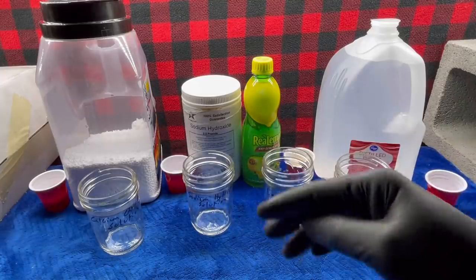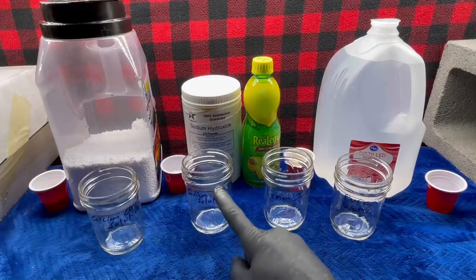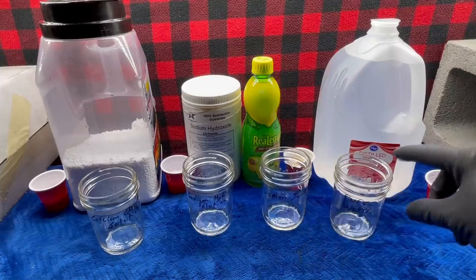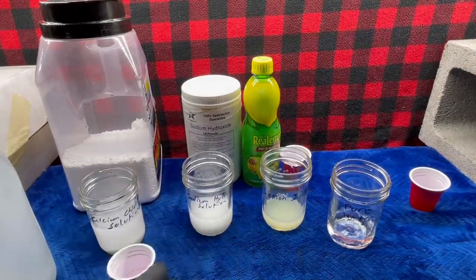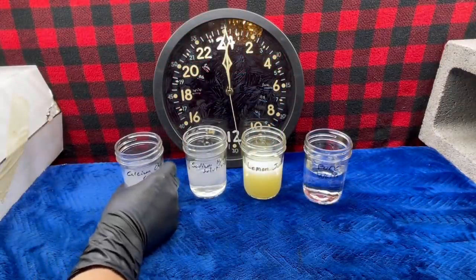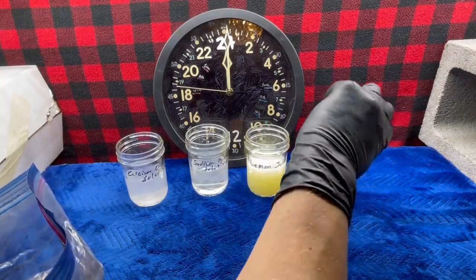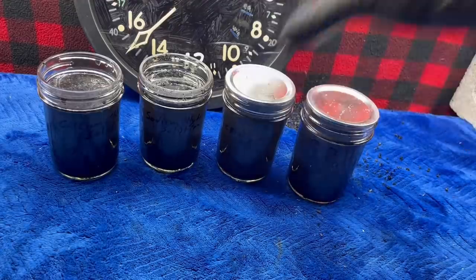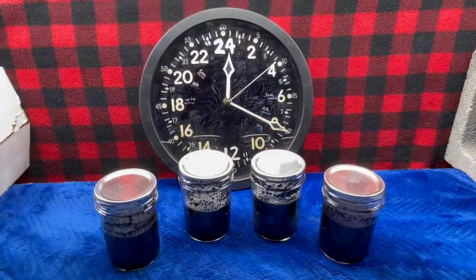Here's what I'm going to use to attempt to chemically activate it — things I've seen people on YouTube and elsewhere using. This is calcium chloride, which will make a 20% by weight solution. Sodium hydroxide, also about 20% by weight solution. Lemon juice, which will be used straight, and a control of pure water. The lids are to keep the bugs out. I'll just let these sit and soak for 24 hours.